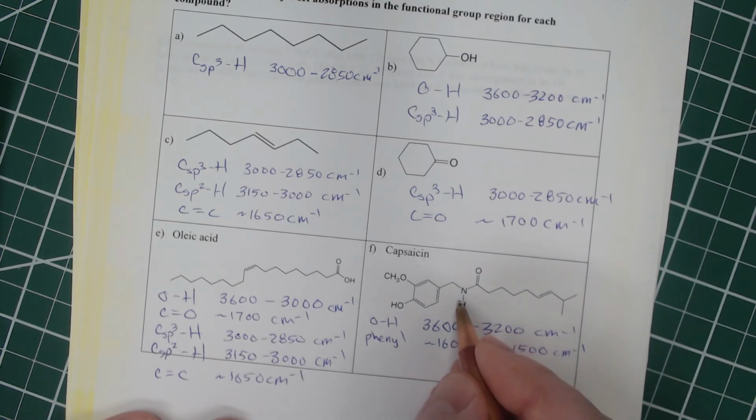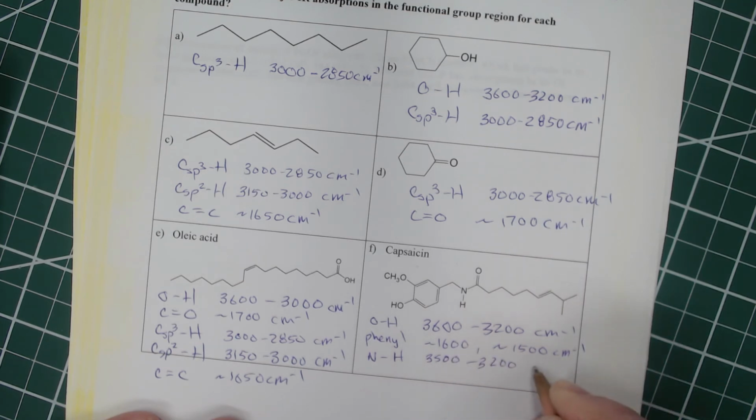All right, let's look at the NH. And that one usually is a little bit narrower than the OH. And so usually it's at about 3,500 to 3,200. And it should be a single peak because we've got a secondary amide here. All right, we got the carbon oxygen, which again is at approximately 1,700 reciprocal centimeters.